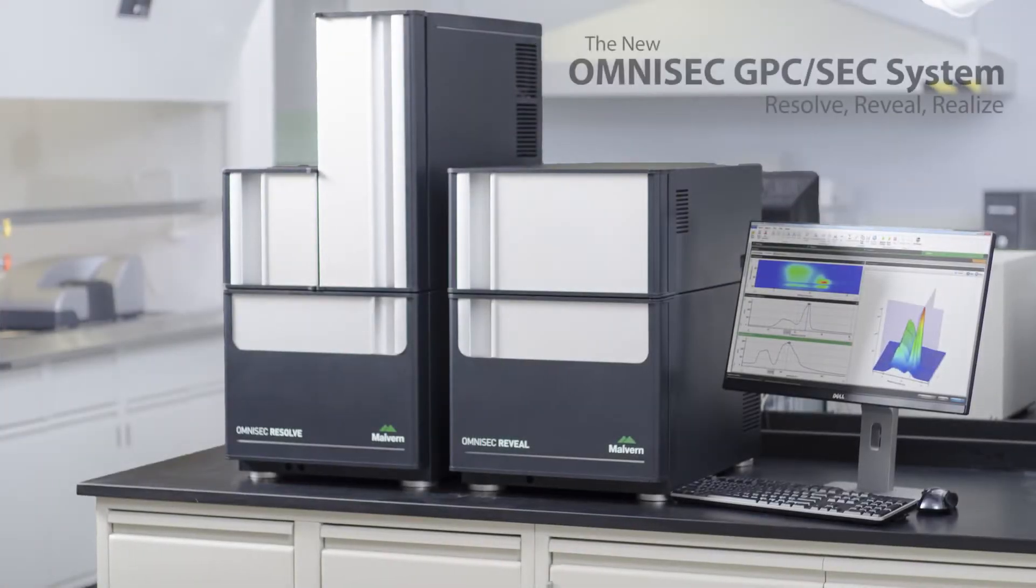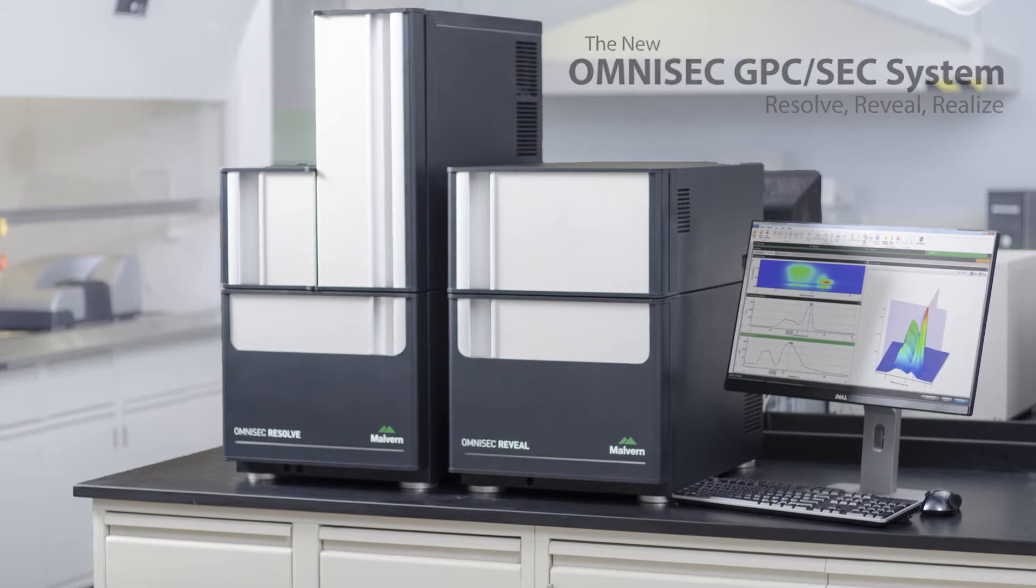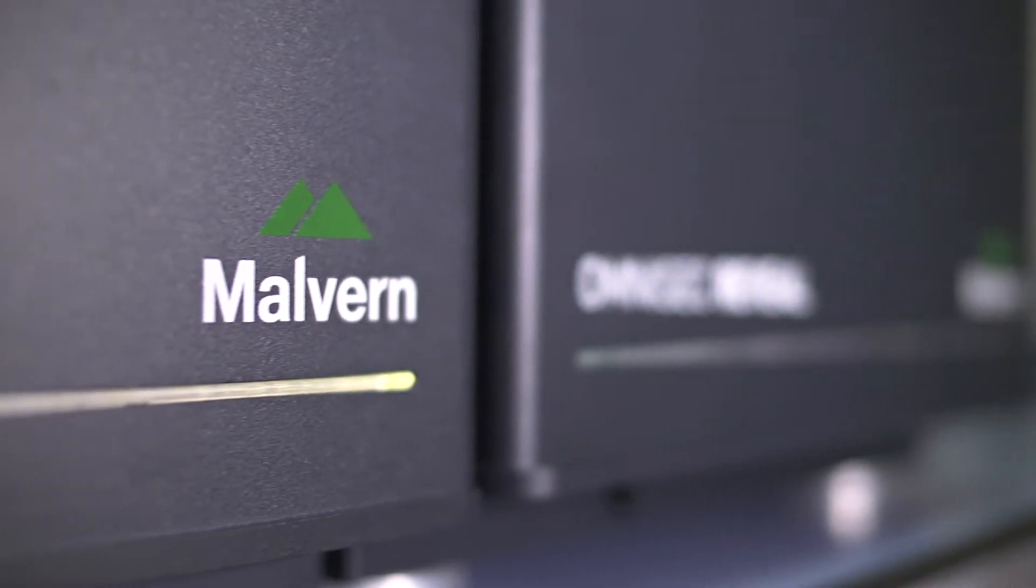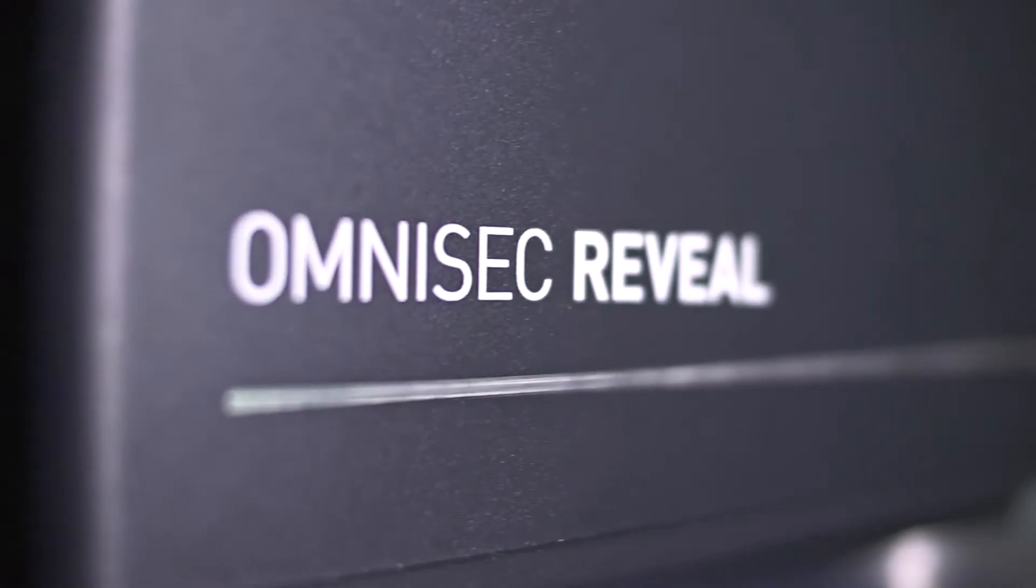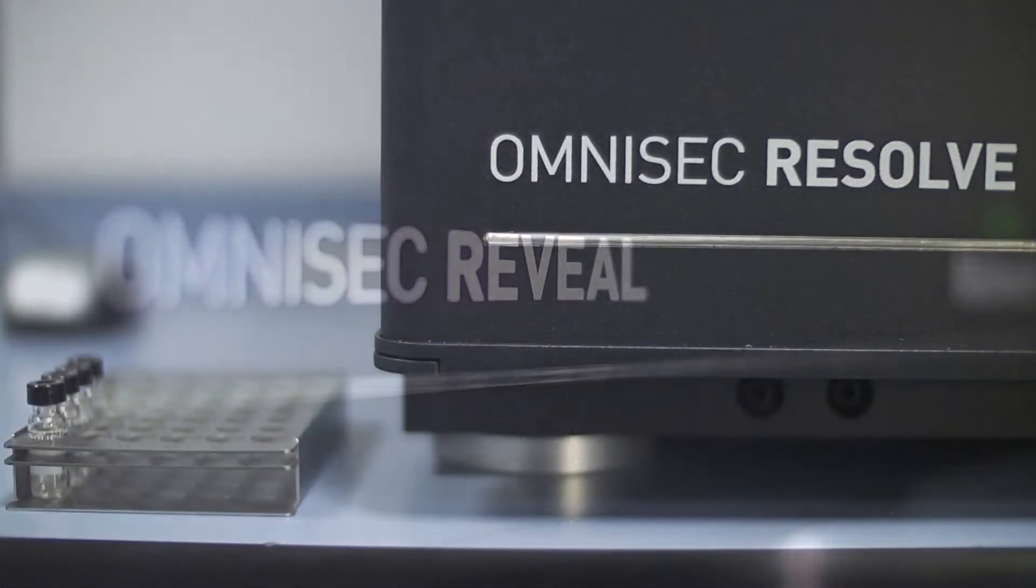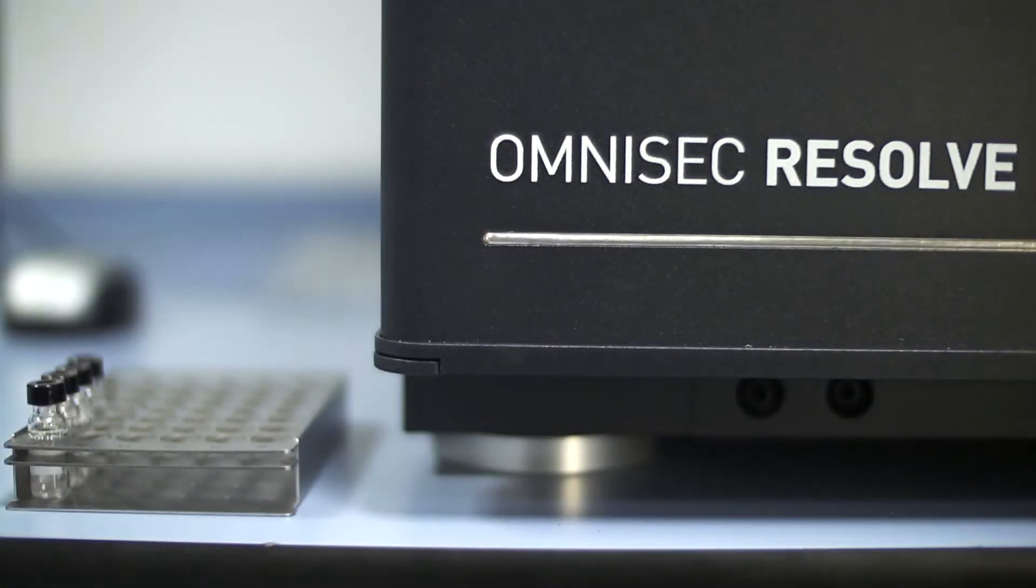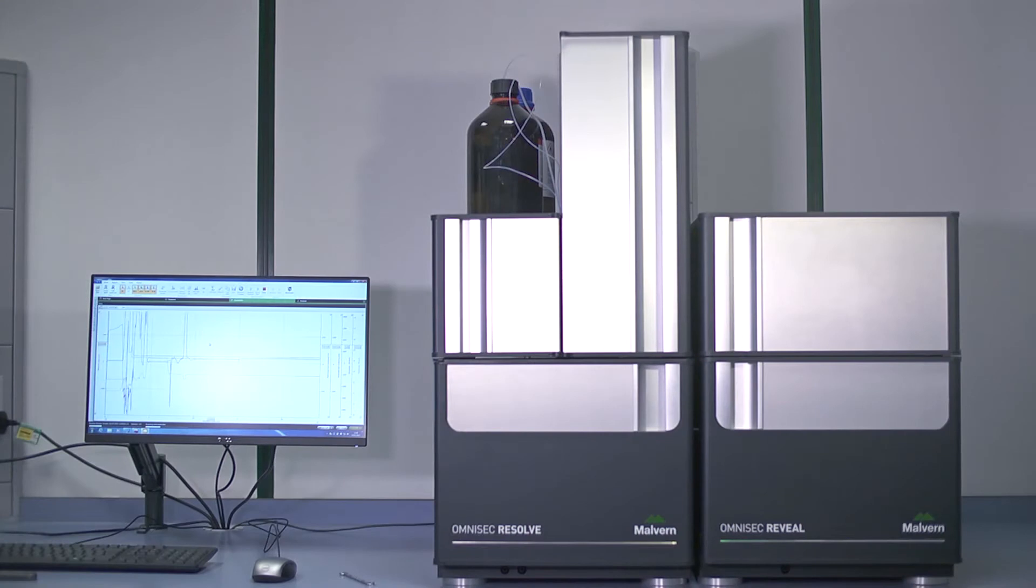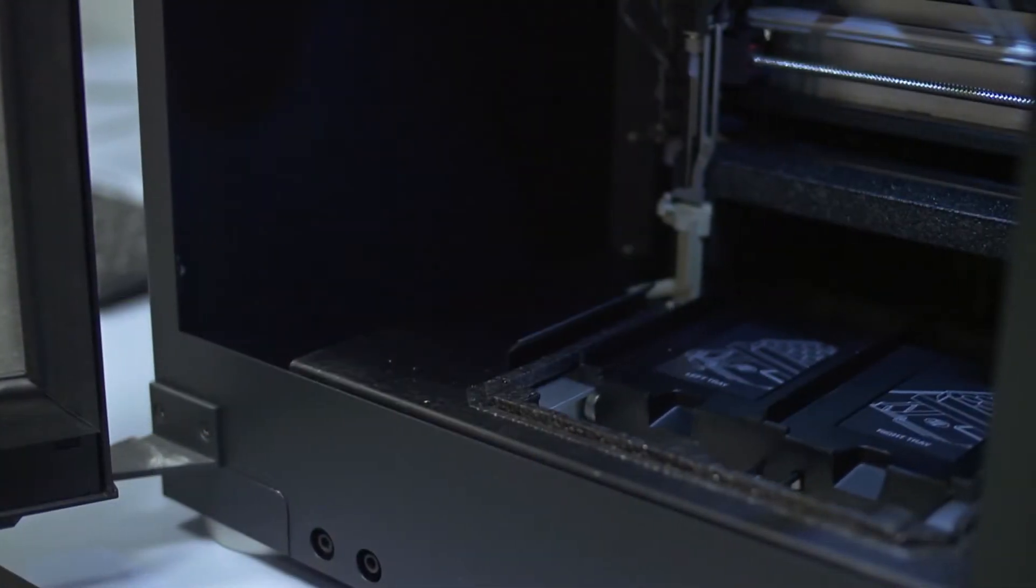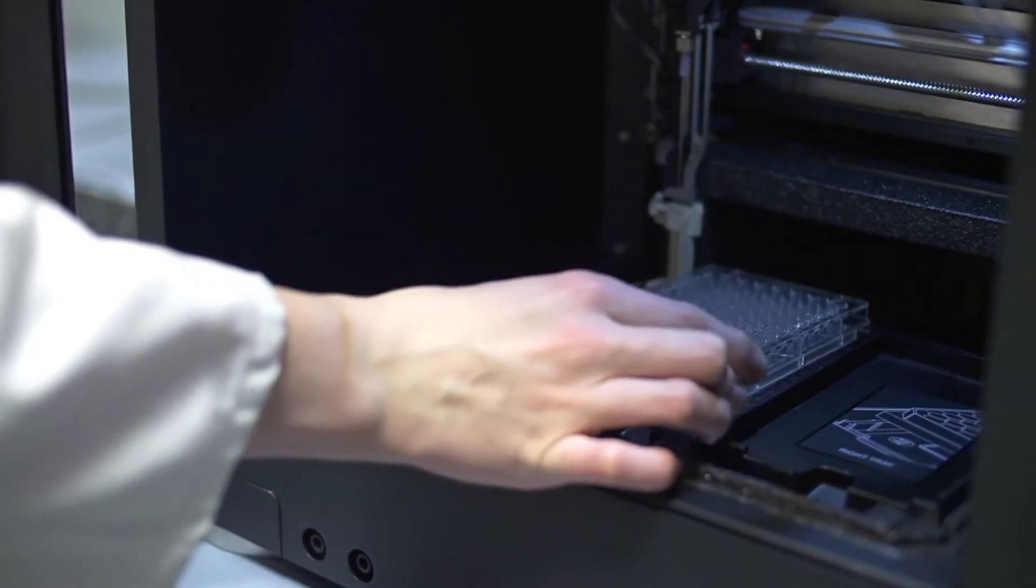OmniSec is the latest size exclusion chromatography system from Malvern Instruments. The technical capabilities we've developed in OmniSec offer significant benefits to key applications such as the measurement of proteins for academic research or in biopharmaceutical product development.